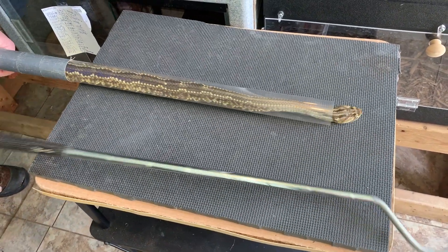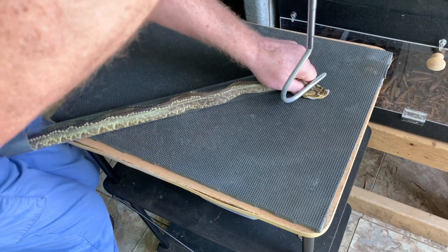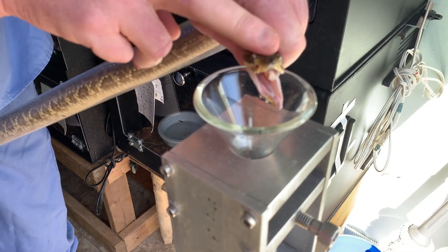Once they are in the tube, he sends them out the far side like this in order to safely be able to grasp the head. From there, he can take them to the funnel and allow them to bite for the extraction.